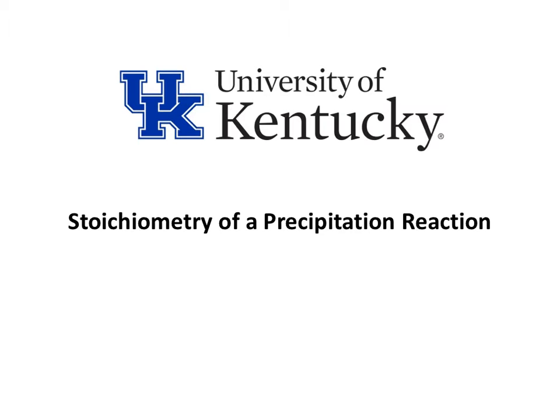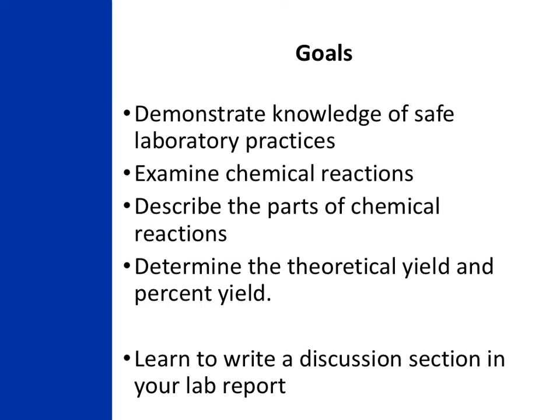In this lab, we're going to be looking at the stoichiometry of a precipitation reaction. In particular, we're going to be looking at a reaction involving a hydrate, which is a substance that also contains water. In this experiment, we are going to continue our focus on building a laboratory safety mindset.